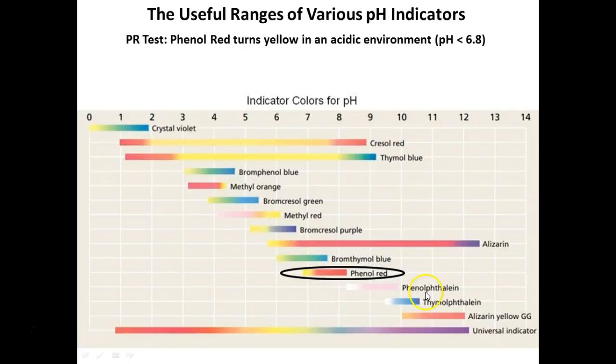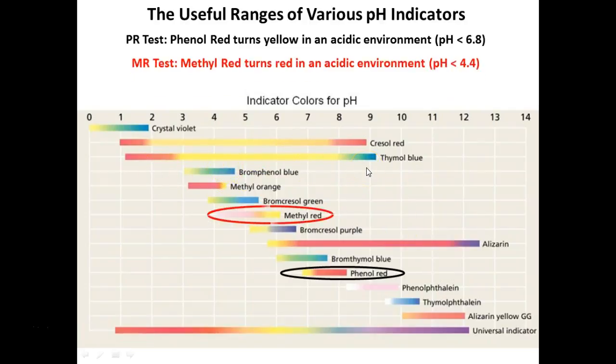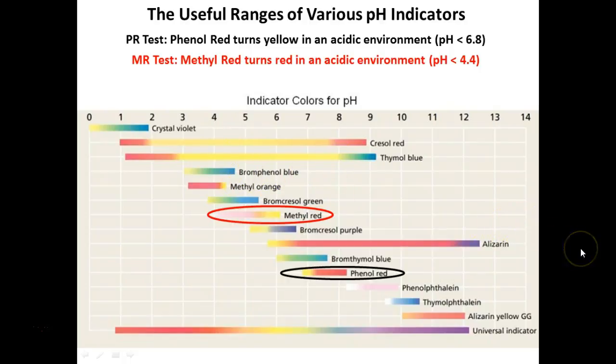So notice bromothymol blue is on here, I think. Yeah, right here. So notice that this one, we're actually going to be looking for it to turn blue, for the pH to actually go up in that media that we're looking at. Oh, this is bromothymol. No, this is a different one, although this one turns blue too. The one that we use next week isn't on here. This was bromophenol, but the other one is a different B, and another one that turns blue.